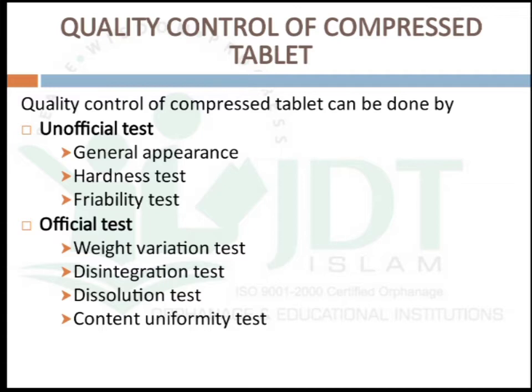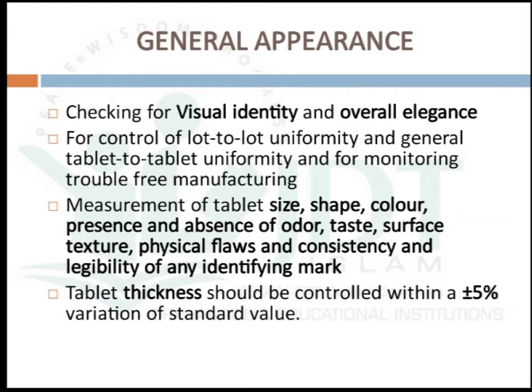Unofficial tests are general appearance, hardness test, and friability test, and official tests are weight variation test, disintegration test, dissolution test, and content uniformity test. Now coming to the first unofficial test, general appearance.